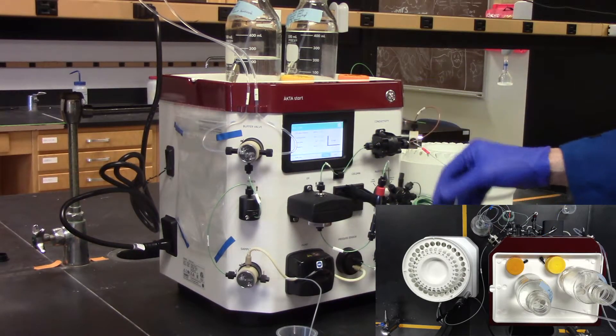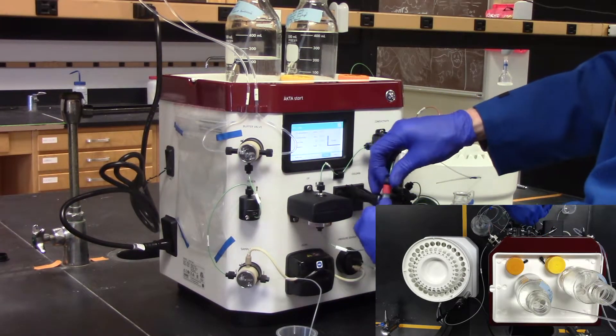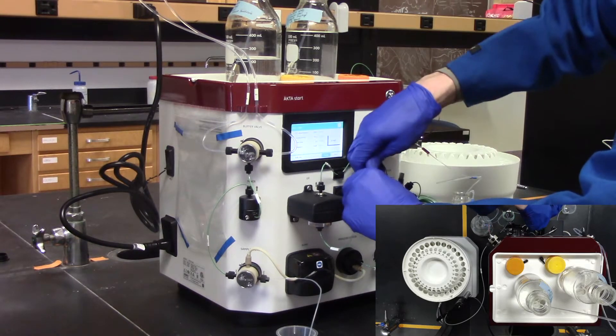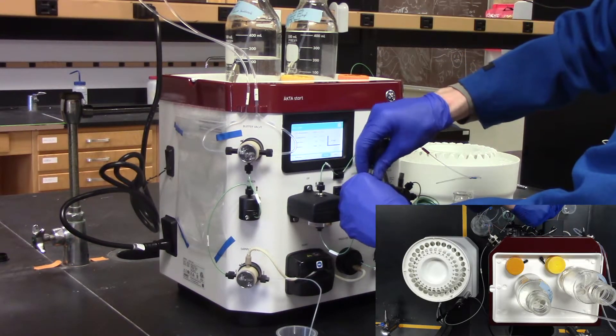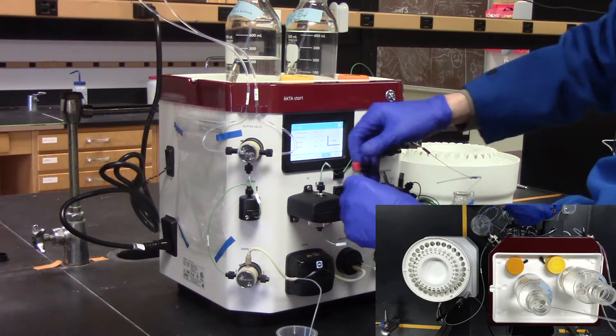End the program and remove your FPLC column. If you have used a USB drive, you can save your chromatogram to the USB drive.